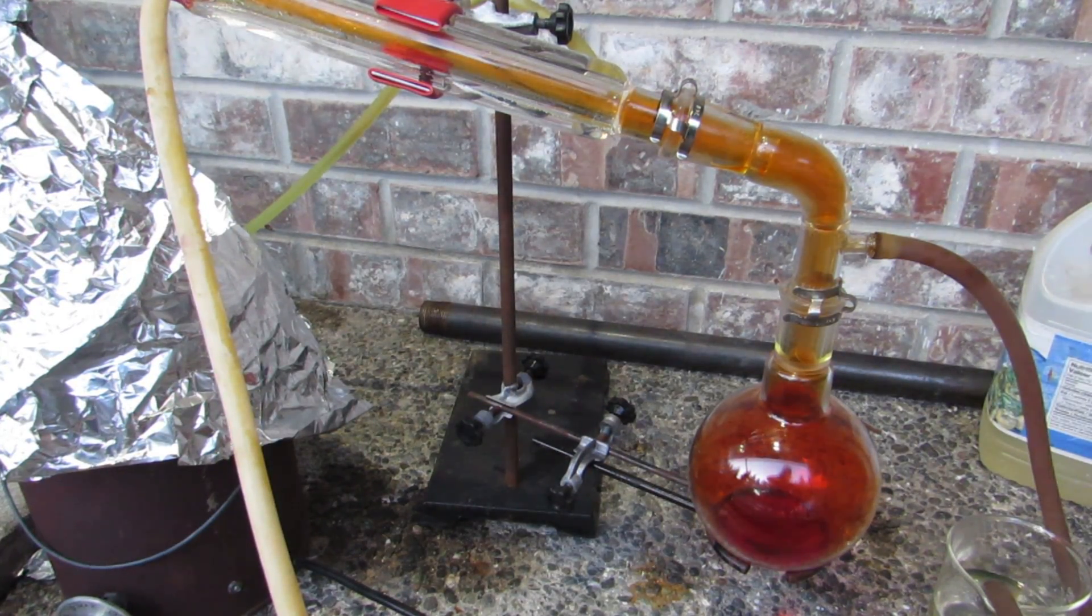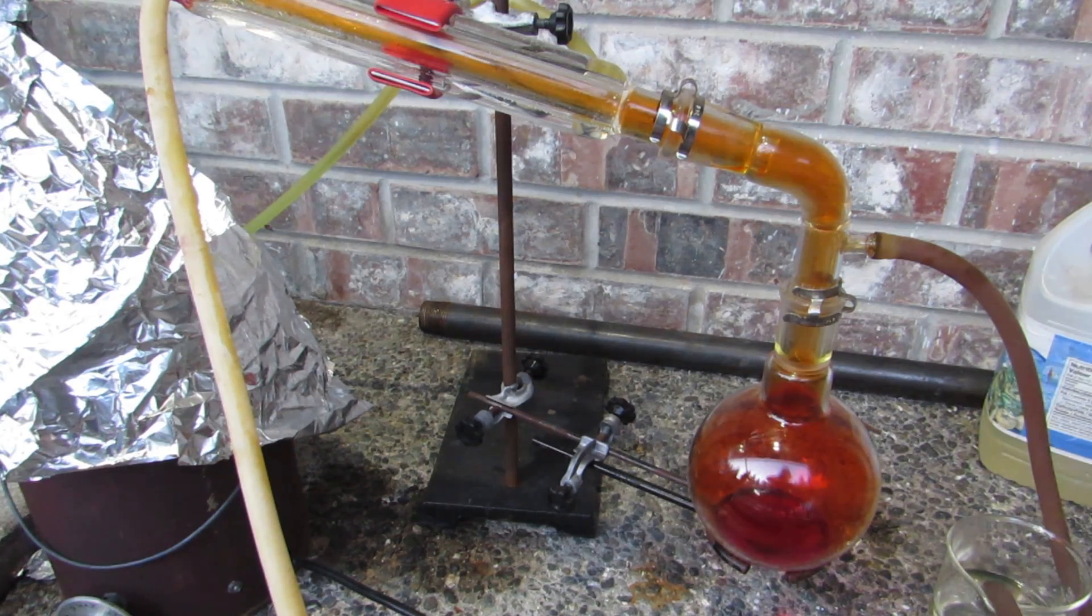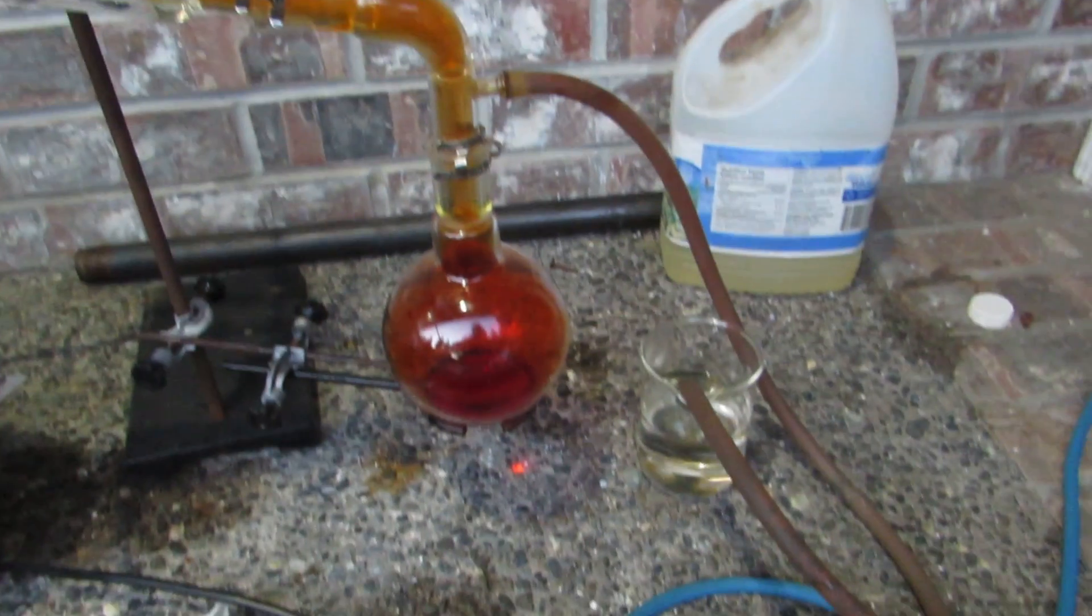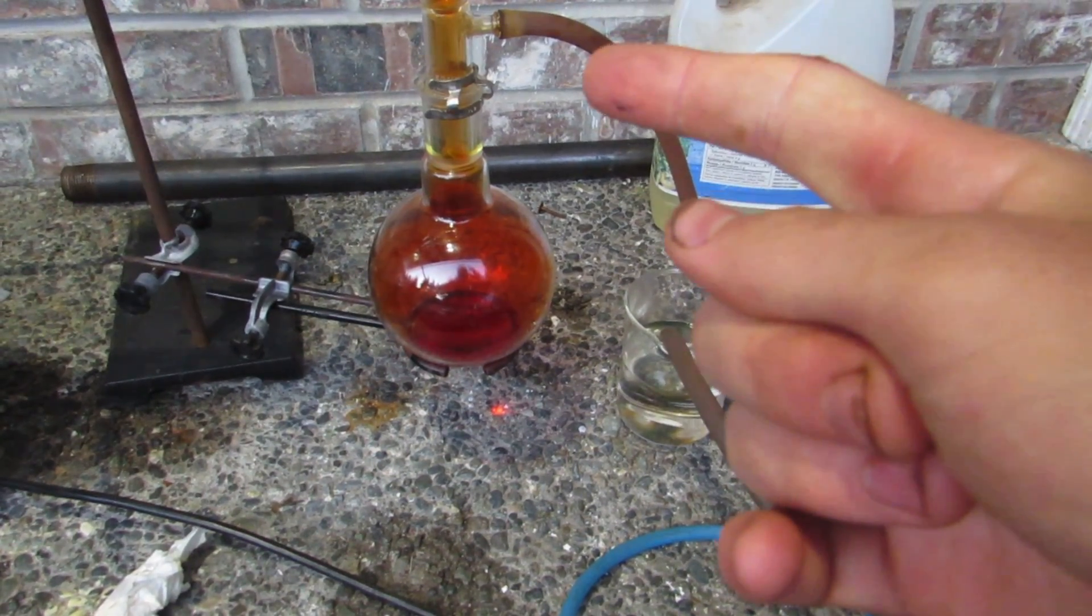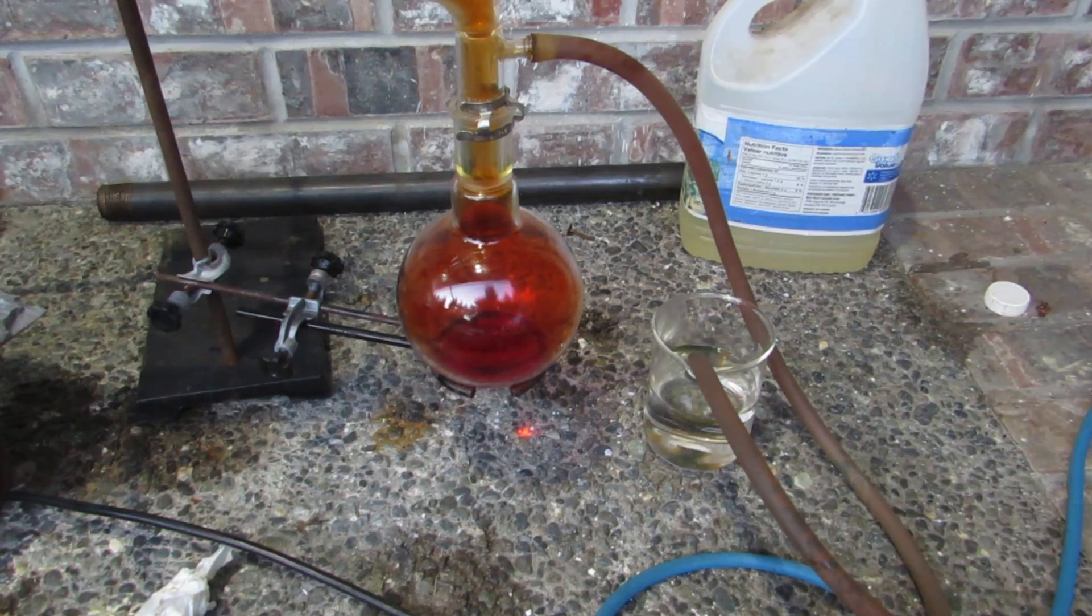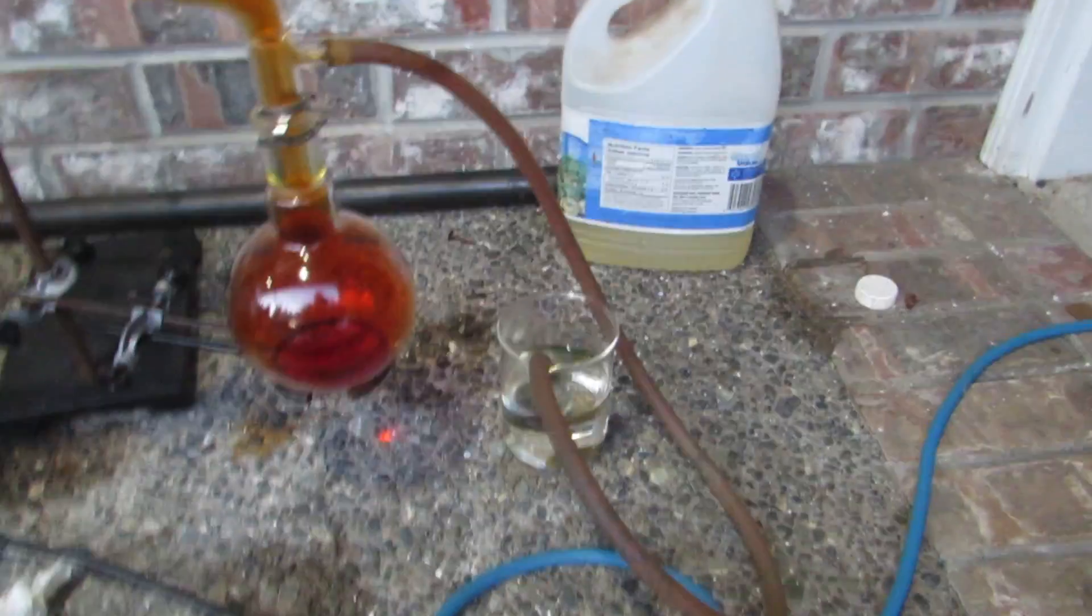As more liquid distilled over, some elemental bromine began forming and filled the apparatus. This is likely from the degradation of the hydrogen bromide. There was also hydrogen bromide being generated directly as a gas and being passed out of the apparatus, so a tube leading into a beaker of water was attached to collect this hydrogen bromide as well.